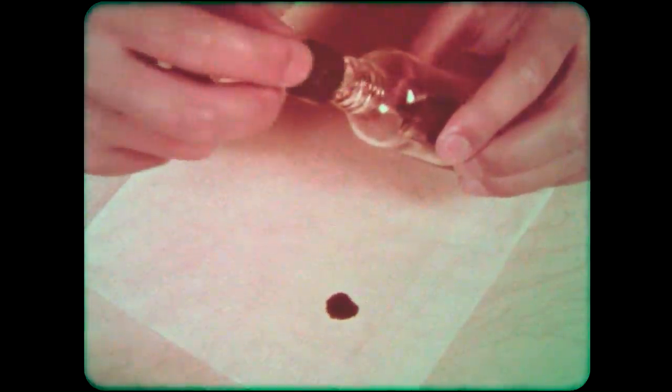After the napkin has been spotted and the ink has been allowed to dry, it is carefully draped so as to draw up the solvent by capillary action. Soon the solvent moves through the substance.